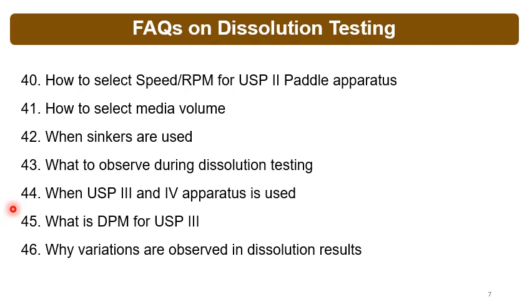When are sinkers used? Whenever the formulations float in the vessel or stick to the vessel walls, or if there is non-uniform landing of the formulation in the vessel, at that time sinkers are used. Sinker use can give you good reproducibility in the dissolution testing.